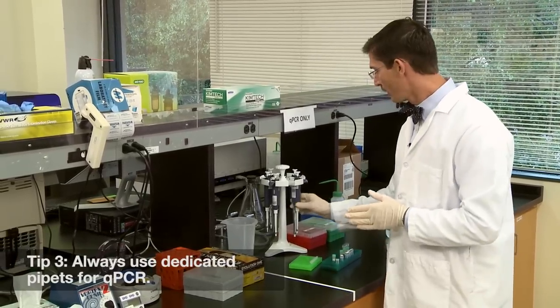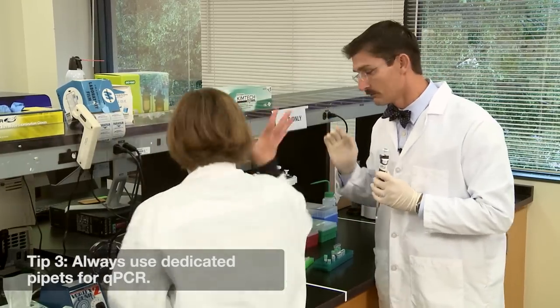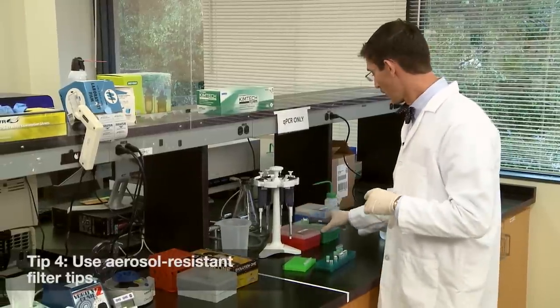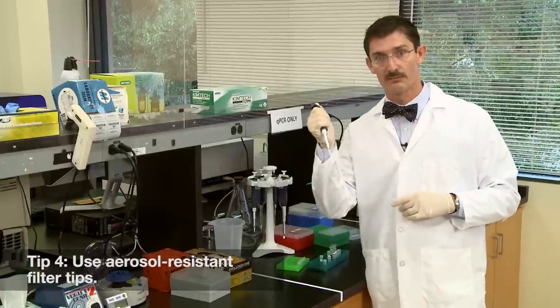Number three: always use dedicated qPCR pipettes and never hesitate to protect them. Number four: together with those dedicated pipettes, use aerosol resistant filter tips.